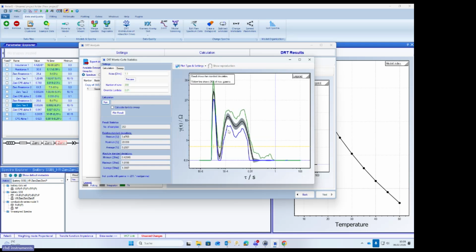So you see here in gray what is more or less the correct or real DRT, because this is something that we get over the complete range. And then you get something like a minimum or maximum DRT. So this is always good. So you see here again, we have these 3 peaks. And if you perform this over a broad lambda value range, then you get here more or less this average DRT. And then this is something you can then just compare with the lambda value that you have selected.